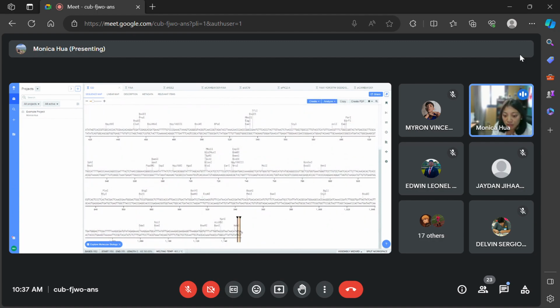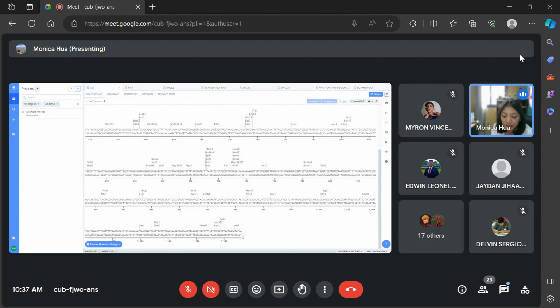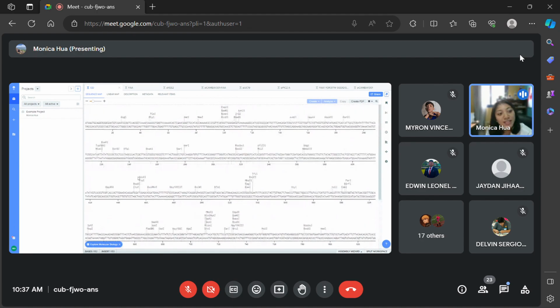Now, your OD sequence already has an ATG, lucky you, I added it for you, right? And also a stop codon. And this sequence is double-stranded, so there's 5' to 3', and there is the 3' to 5'. What I mean by it's easy is that in order to make a primer, usually we don't want it to surpass 20 base pairs.